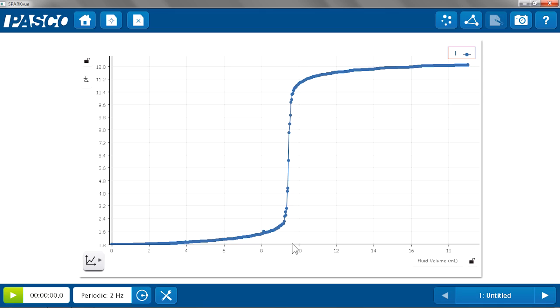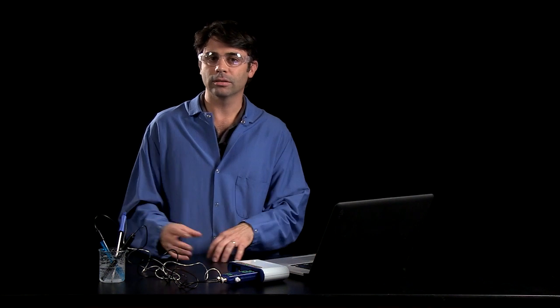Here's the pH curve. Typical of what you would expect. Very, very classic pH curve for a strong acid-base titration, with our equivalence point somewhere around 7. But, again, the interesting thing is I can look at lots of other stuff at the same time. I can look at the temperature.